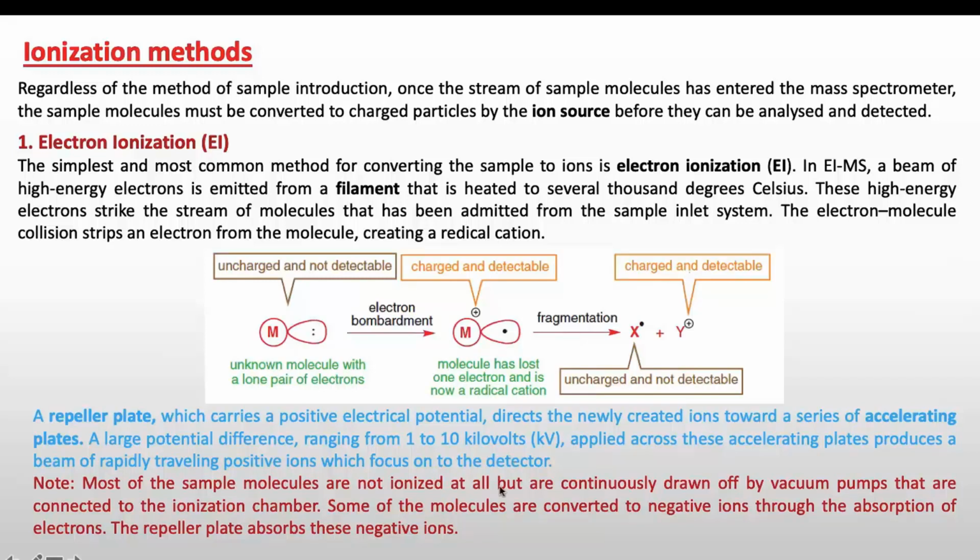This means that when you bombard your neutral molecules with electrons, only some part of the sample is converted to radical cations. The part which is not converted is drawn off by the vacuum pump, which is connected to the ionization chamber. Some of the molecules are also converted to negative ions through the absorption of an electron, because it's not necessary that an electron is always removed from the molecule. Sometimes it can also absorb electrons, and then it will have a negative charge. Because we are using plates that pass only positive ions, the negative ions are attracted to the repeller plates. So finally we have only cations and radical cations going towards the mass analyzer or mass detector.